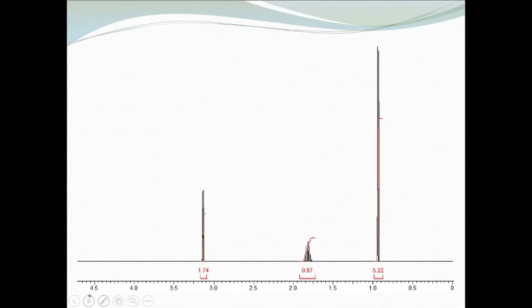All right, so let's see how all that is used. Note first that we have this axis along the bottom, our x-axis. The units aren't here. We should have units ppm, which stands for parts per million. This is our normalized frequency.